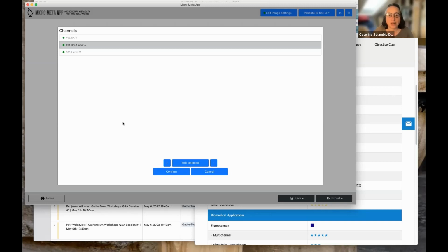One thing that would be great to do and could be done relatively quickly is, for example, with filters and objectives, because a lot of information is already available in the public domain. For example, Zeiss exposes a lot of this information. So if we could make these available in a way that we can use directly, that would be great. So we are working on multiple fronts to achieve that goal.